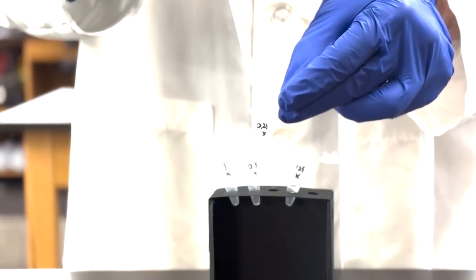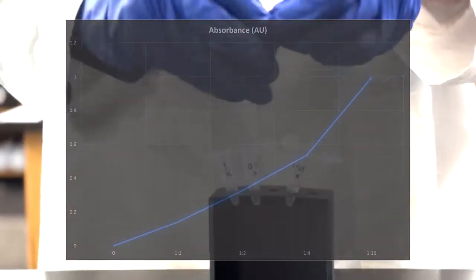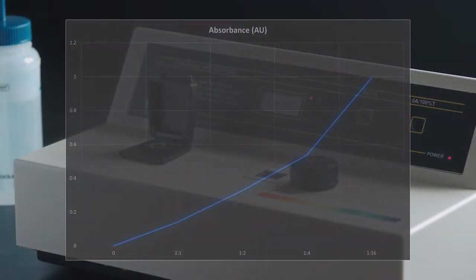They can be used to prepare a standard curve. The standard curve serves as a reference or calibration tool that allows you to quantitatively analyze the concentration of unknown samples.